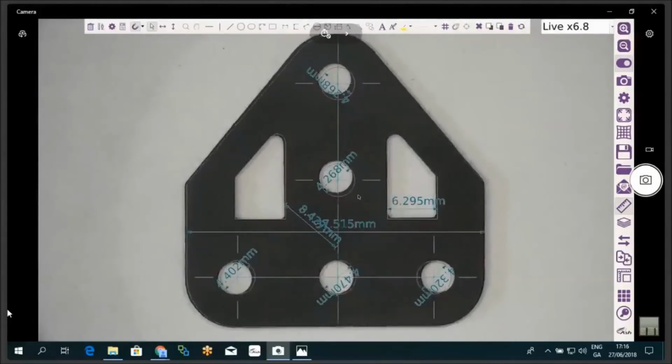And this is a really powerful feature because it means that an R&D department or an engineer can pass over CAD drawings, which they would usually have anyways. They can bring them over to production or QC. So again, it's time saving. You don't have to create your templates or your measurement files.